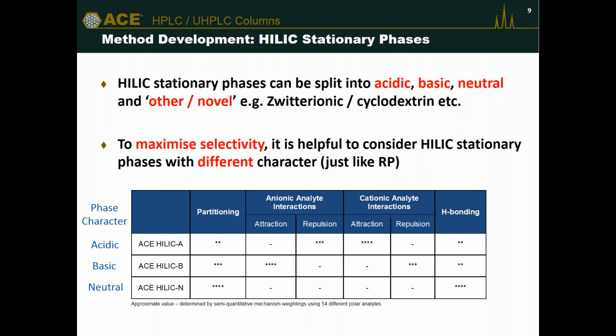This type of characterization is common in the column chromatography world, and such data is available also for reverse phase chromatography. What this does is it allows us to explain how the different properties of the columns have been designed to help with different types of separations.